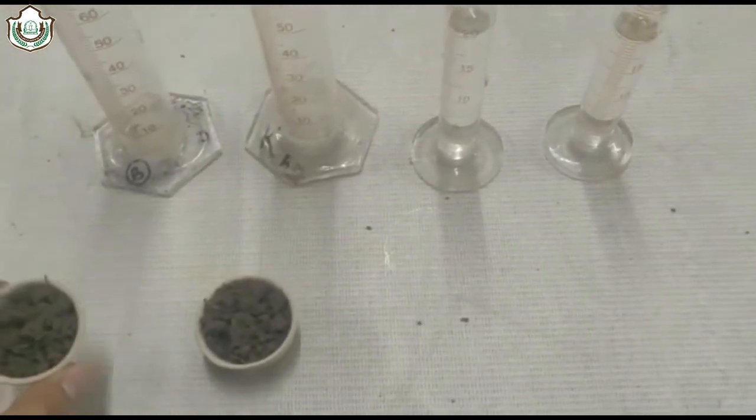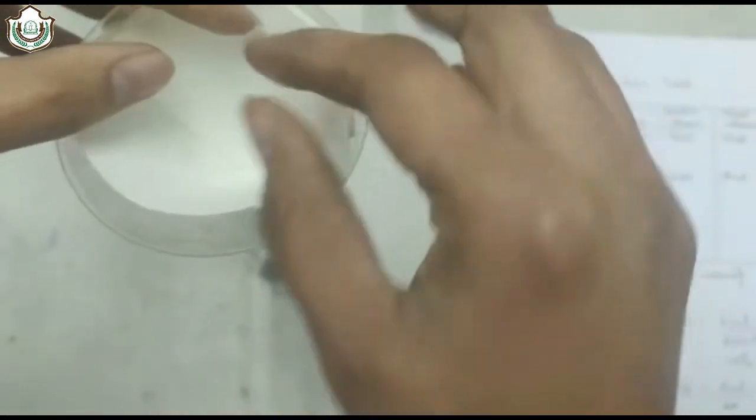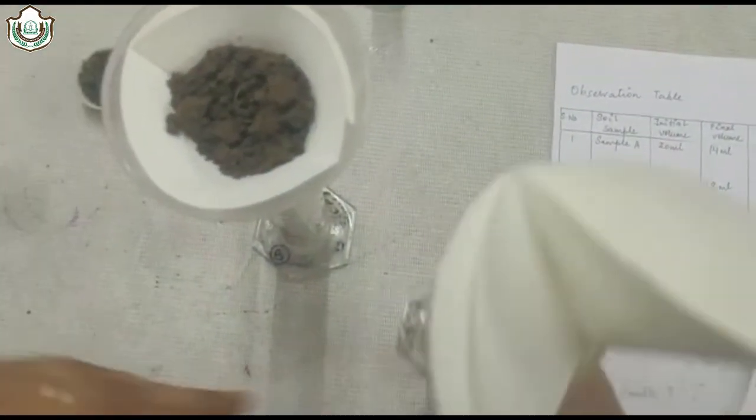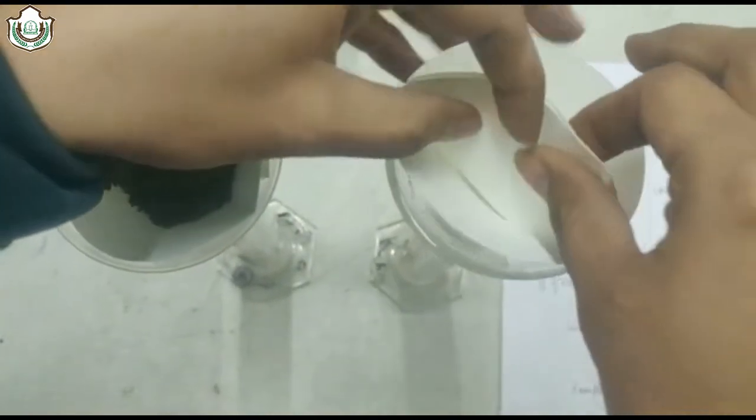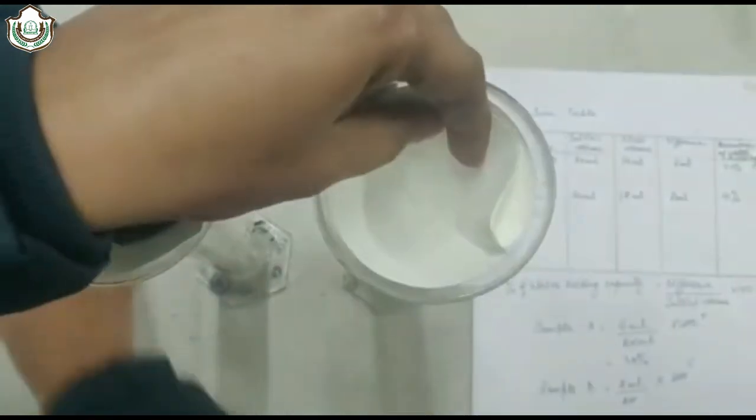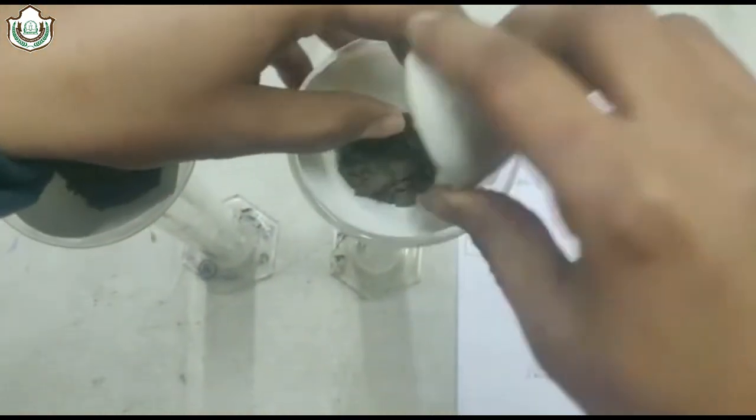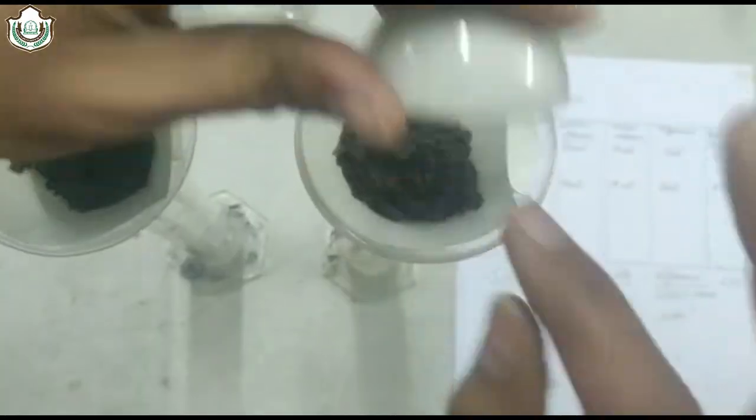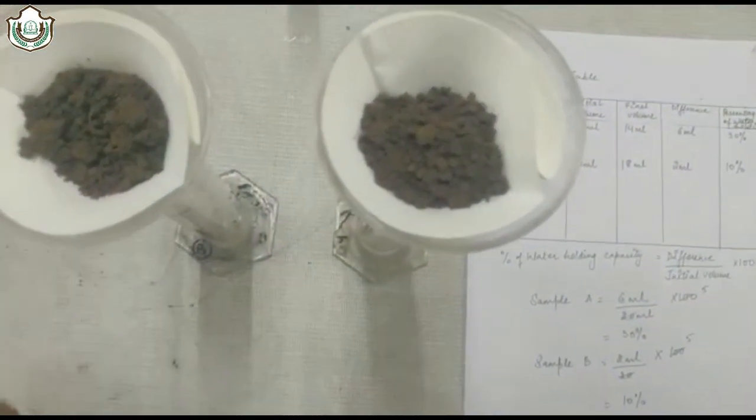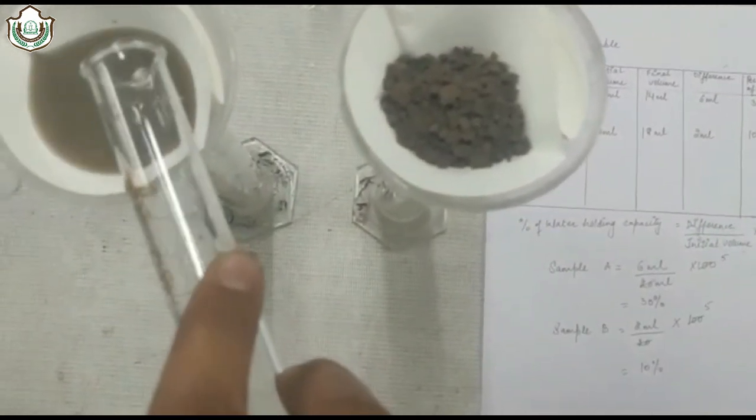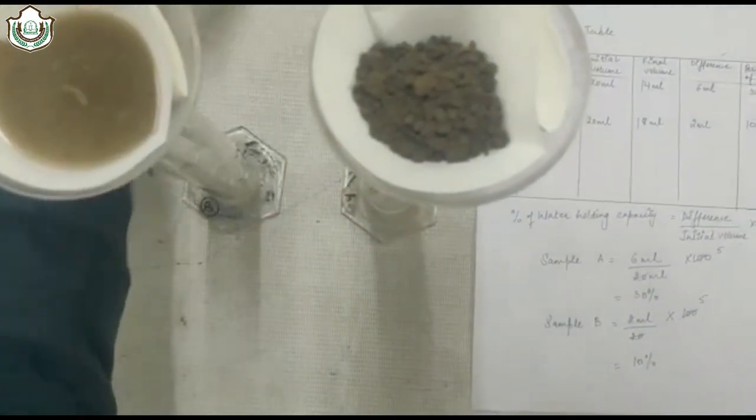We have 20 grams of soil. Now add 20 grams of soil sample A in one measuring cylinder and soil sample B in the next measuring cylinder.